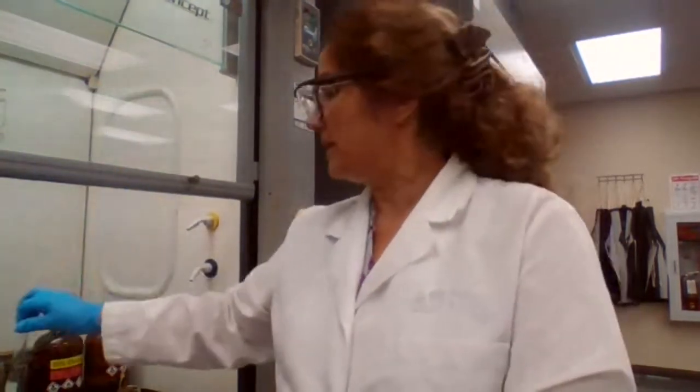I don't have the reagent for the Schiff test. The reagent is not here. We don't have the reagent. That's why I had to skip it. But the result would be very similar to the chromic test, very similar. We usually have two methods in case the lab doesn't have one of the reagents, you can use the other one. But since we already had the Tollens and we had the chromic acid reagent, we are fine.